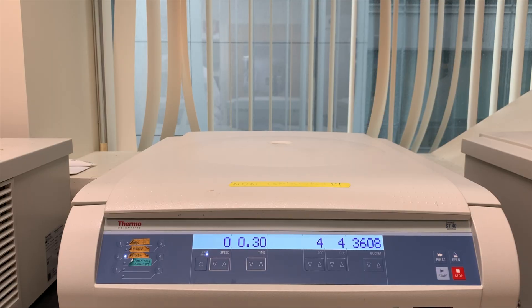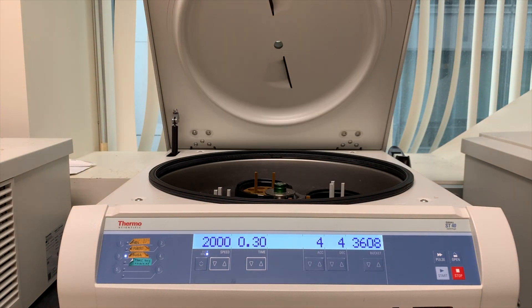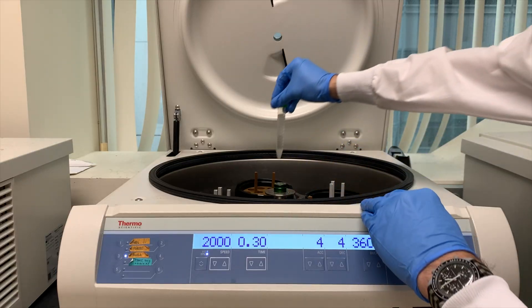Okay, once we have our samples layered, we can centrifuge them. I recommend setting this up in advance so you minimize the time that the RBC layer has to start falling through the Ficoll. We'll run it at 2000 RPM for 30 minutes, with the acceleration and deceleration set to 4. We also need to make sure that the centrifuge brake is off, so there's a gentler deceleration, and that'll help to preserve the layers we're going for. Always remember to add a balance.